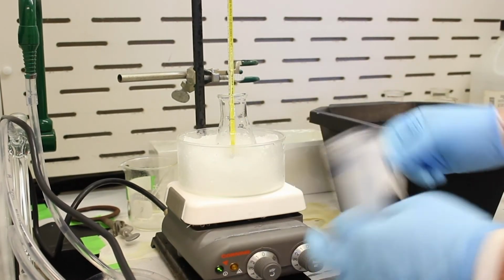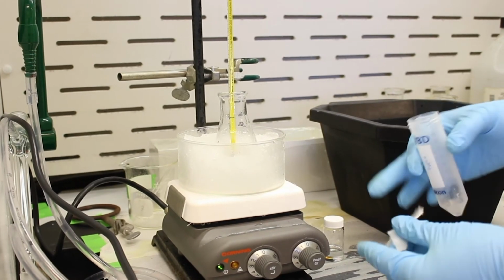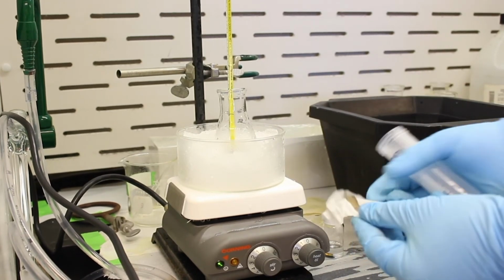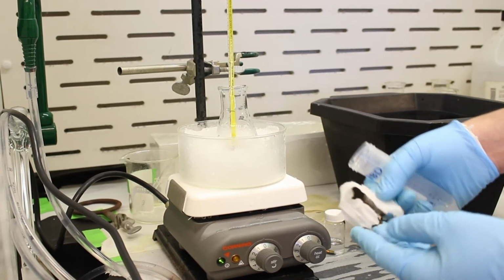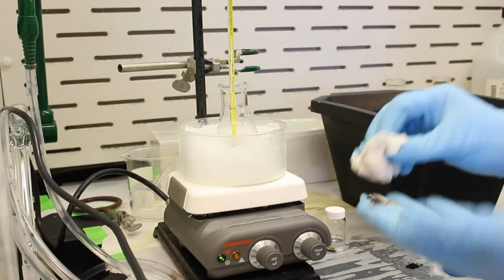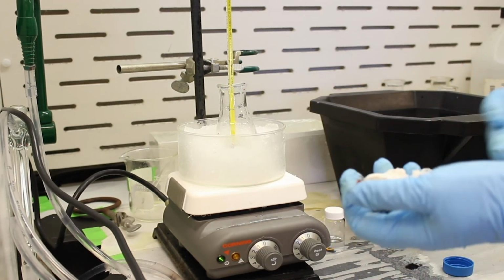So it's very important you don't get these chemicals on you, the acids, because they can quite readily dehydrate your skin. So if we put a little bit of sulfuric acid on the paper, you can see immediately it dehydrates the paper. Okay? And it gets quite warm doing that. So you can see it's gotten on my glove a little bit here. I'm going to change my glove and be right back.